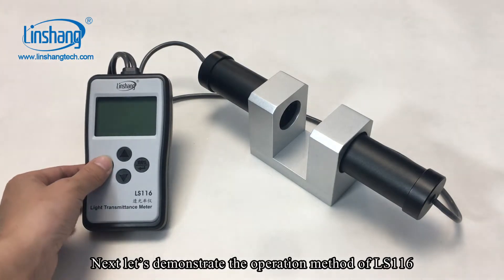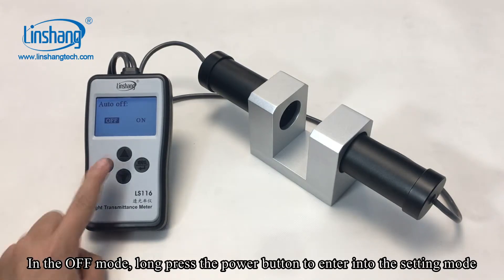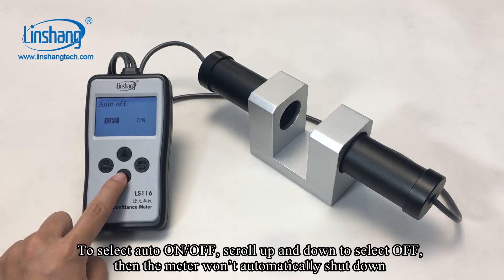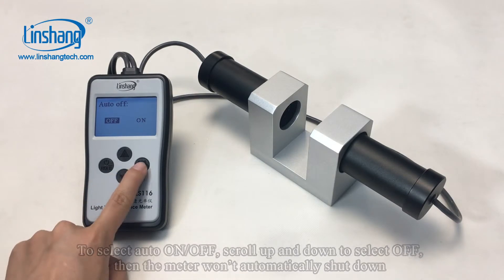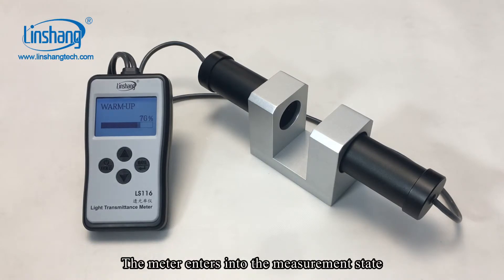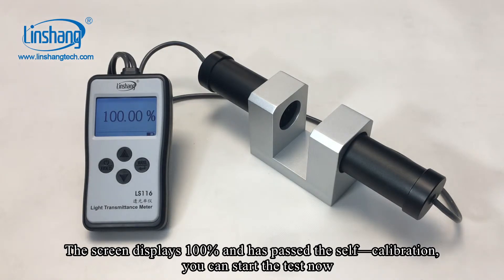Next, let's demonstrate the operation method. In the off mode, long press the power button to enter into the setting mode. To select auto on/off, scroll up and down to select off so the meter will automatically shut down. Short press the confirm button. The meter enters into the measurement state. The screen displays 100% and has passed the self-calibration. You can start the test now.